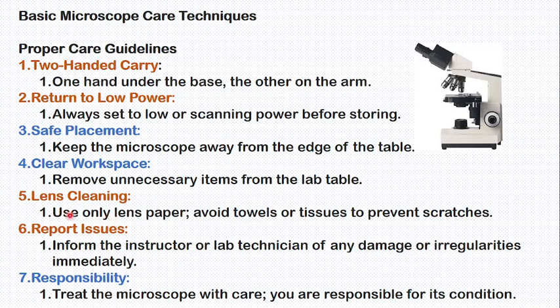Just means maybe you are a lab technician, or you are an operator using a microscope. Remember, if you are a student, notify your teacher that your microscope is not working properly. Now you should take responsibility. Treat the microscope with care. You are responsible for its condition.